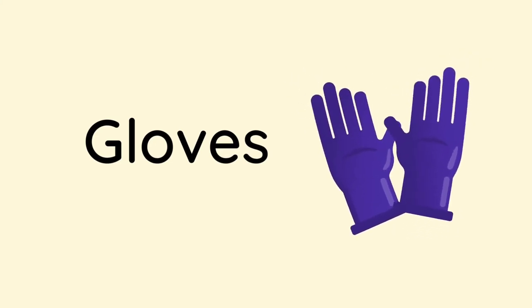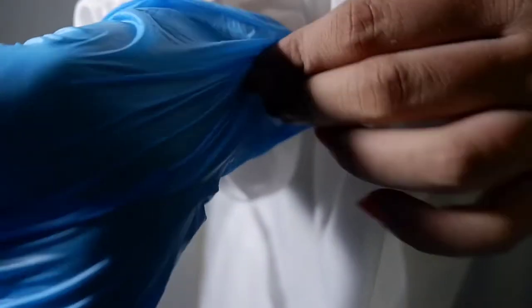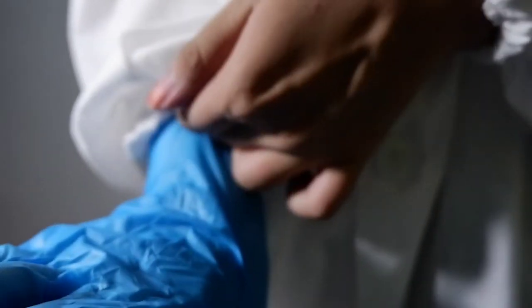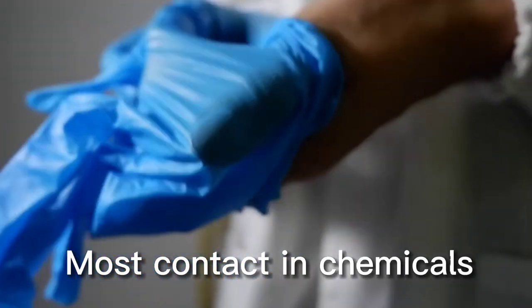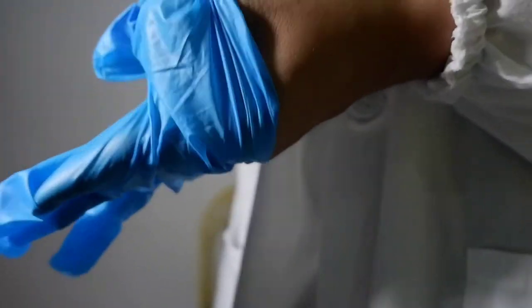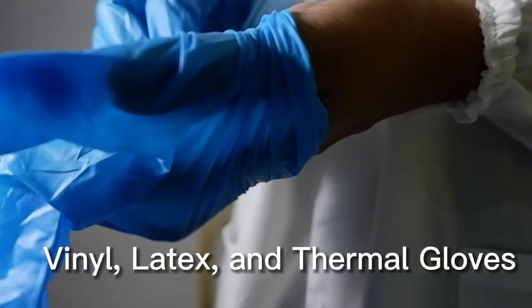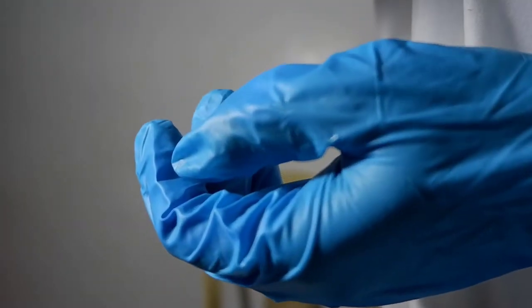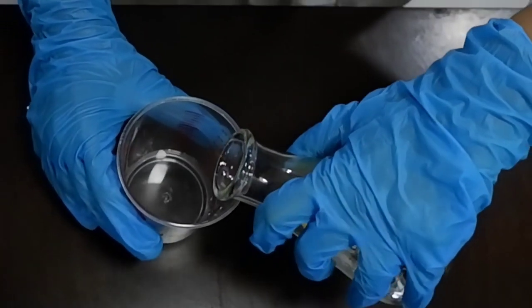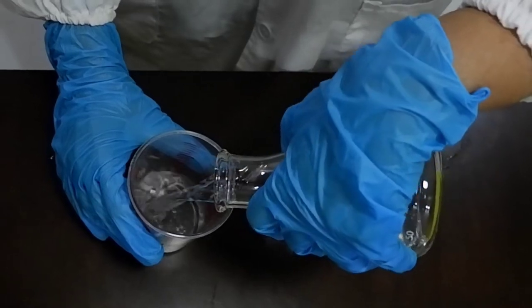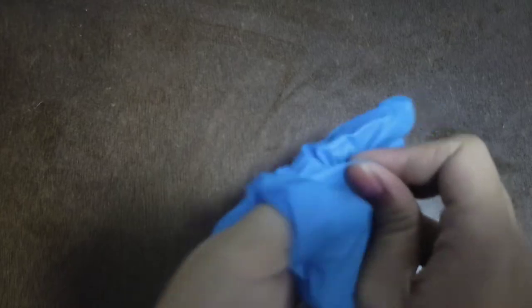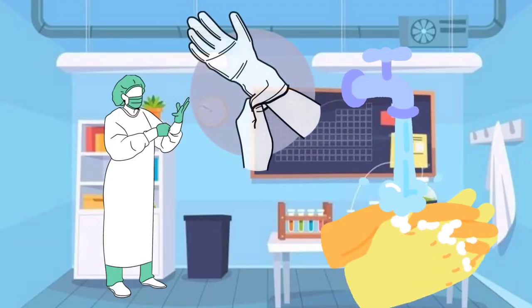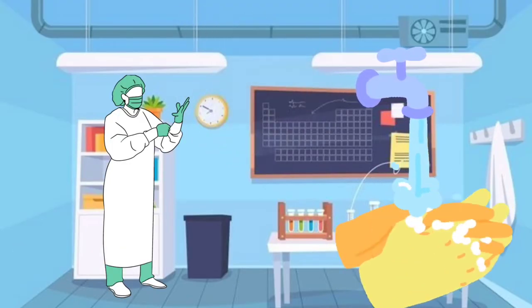Hand protection: gloves. It is very essential to always wear gloves, as our hands have the most contact with chemicals during lab experiments. There are various types of gloves, such as vinyl, latex, and thermal gloves. Choose carefully according to the type of chemicals you're working with. Chemicals can be absorbed through gloves, so it's important to change gloves over time and wash your hands frequently when handling different chemicals and glassware.